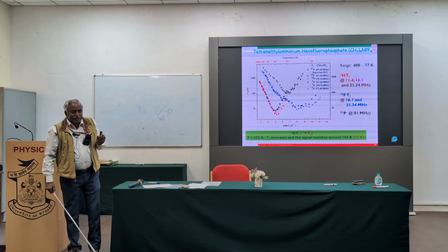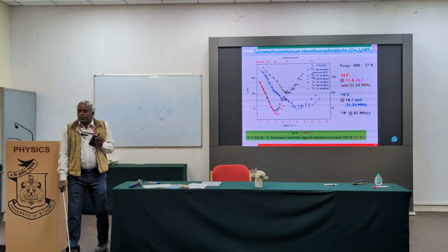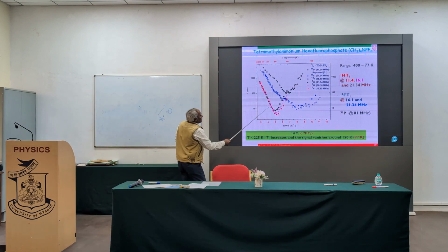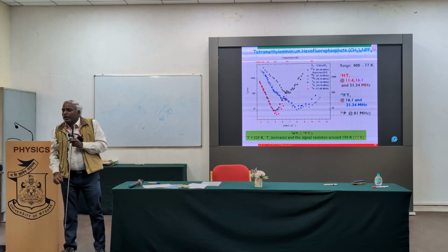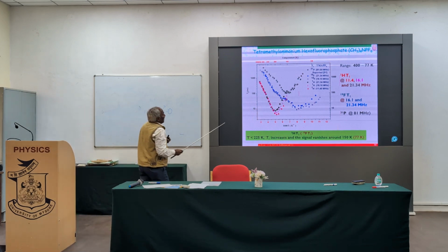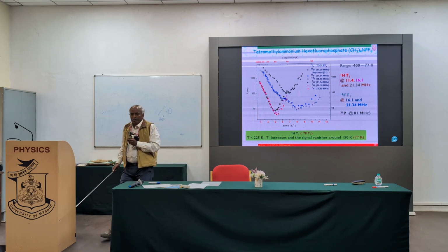That would enable us, even if I intentionally did not add the complex mathematical expression associated with it, I can fit all the data and get different peaks, all following the same behavior. This point is more important for me. At this point I have the minimum relaxation time, about 4 to 6 milliseconds. Within 4 milliseconds they are grabbing it and taking it down. So that means the efficiency is highest, the relaxation time is minimum, and the relaxation strength is maximum.